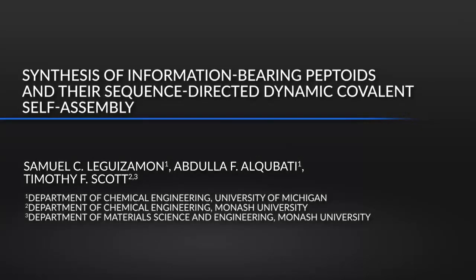This protocol enables the information-directed assembly of oligomeric sequences by dynamic covalent interactions, truly mimicking the sequence-selective hybridization of nucleic acids, but with increased interstrand bond strength. Dynamic covalent assemblies are typically restricted to simple architectures, owing to their limited capacity for bond rearrangement and error correction.